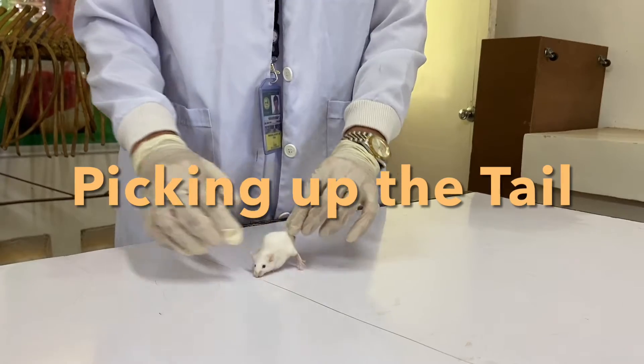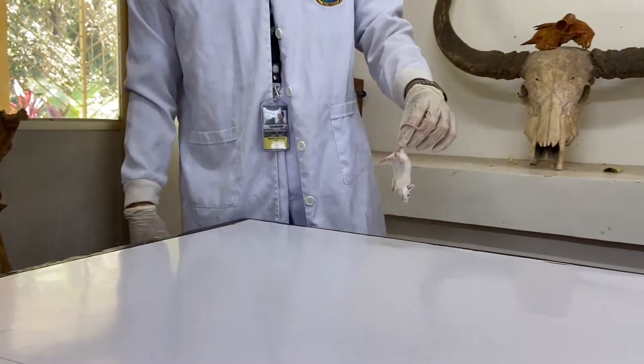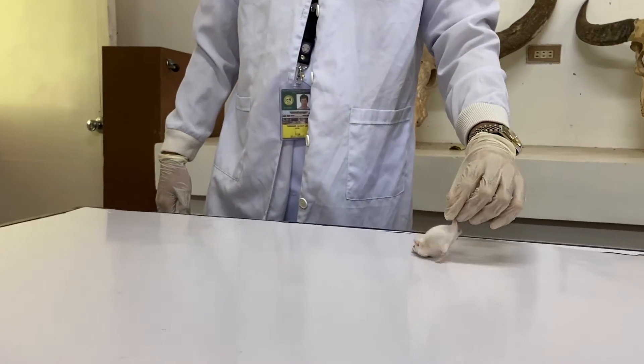Picking up the tail: grip the mouse by the base of the tail, lift it up and carry it to the new destination.